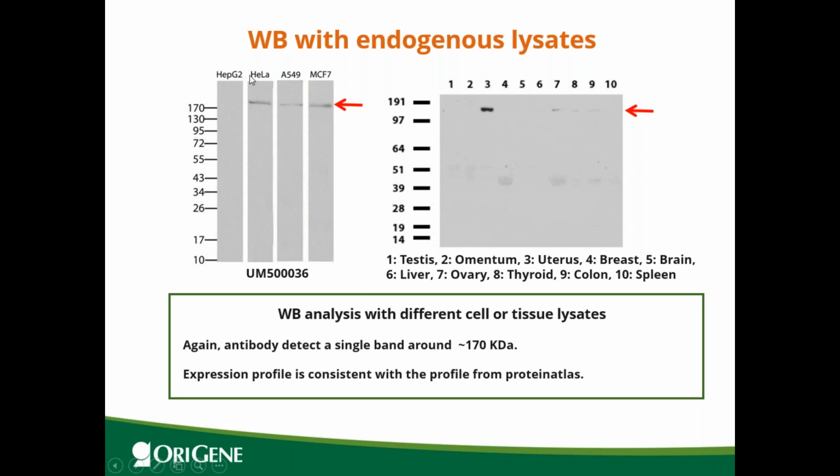And if you compare the expression profile from this antibody, it is consistent with the expression data that you can get from the public database, such as Protein Atlas. So this also indicates the specificity of these antibodies.